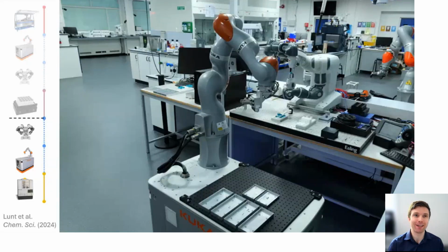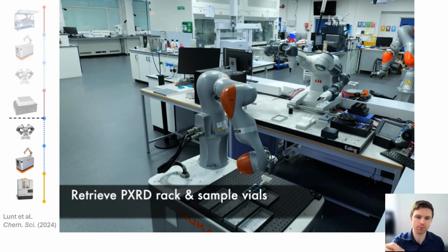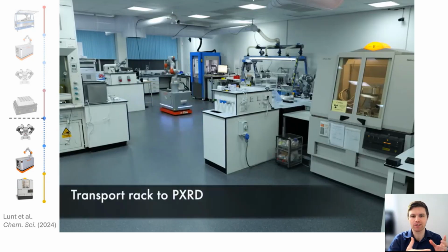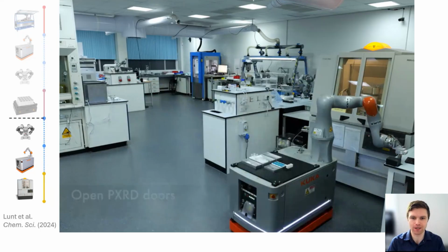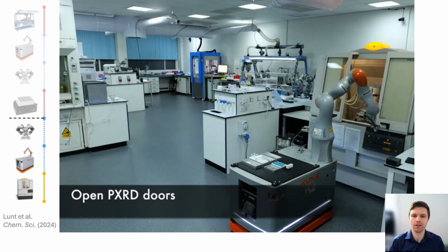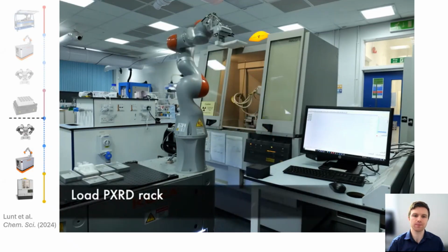Here we have an example of a self-driving laboratory that actually does some driving. Not all do. But here we have a dual-armed robot uncapping vials and passing them to a mobile manipulator, a robot arm on wheels, that takes the samples and brings them over to an X-ray diffraction machine to characterize powders. This is highly sped up, by the way. We make it over, it calibrates its position against this block, opens one door, opens the other door, calibrates again to be able to pick up the samples and insert them into the machine.